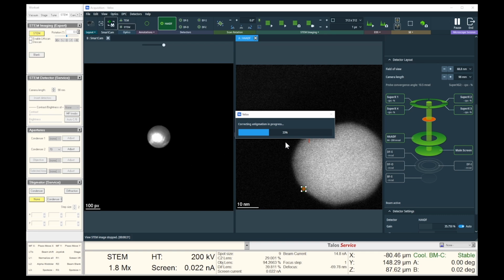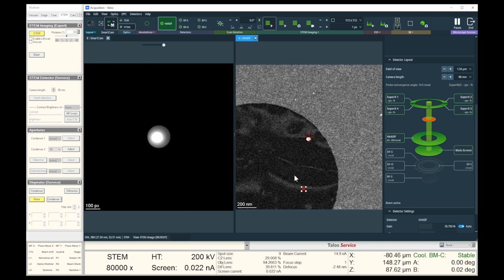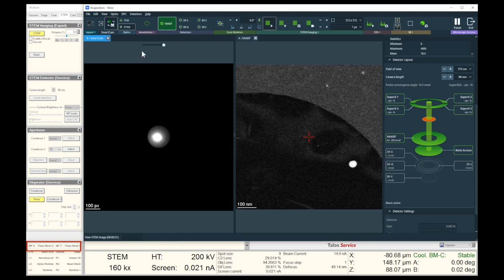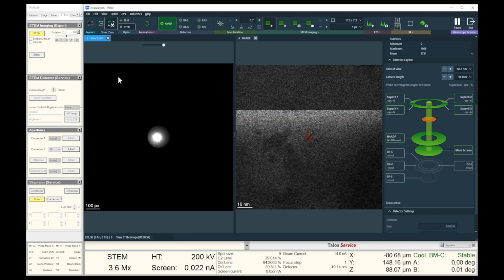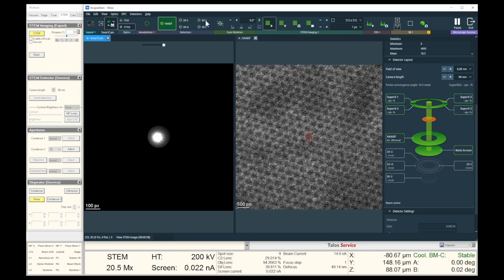Once the focus and astigmatism are adjusted, a typical ptychography experiment uses either over or under focus conditions for more probe overlapping. In this experiment, we used in-focus condition to stay consistent with the paper. Now let's shift the stage to our region of interest. Here I use piezo controls for the X and Y axes for more precise stage movements and fine-tune the imaging conditions.